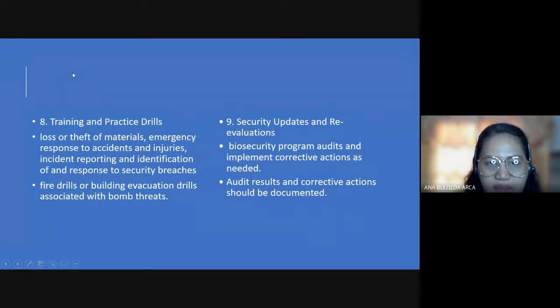Again, training and practice drill. This is very good pagdating sa mga emergency. So, dapat meron kayong fire drill, building evacuation drill associated with bomb threats. Loss or theft of materials, emergency response to accident or injuries, incident report and identification of and response to security breaches. So, ano yung mga practice nyo, yung mga trainings nyo, just in case nangyari ang mga bagay na ito.